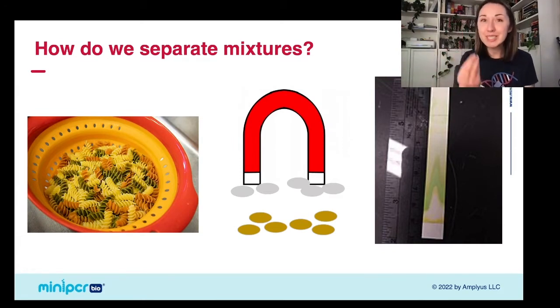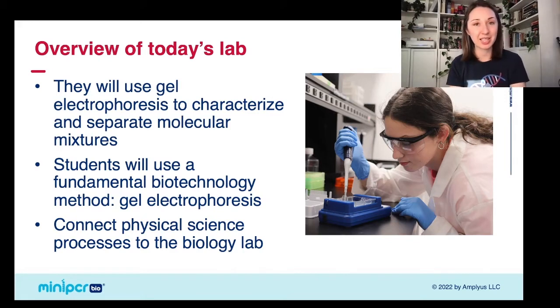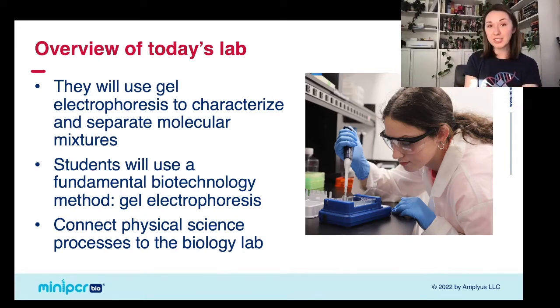And by doing that, we're going to really understand the fundamentals of how gel electrophoresis separates DNA molecules based on their properties and characteristics. So that's what we're going to do in today's lab. Students who perform this lab are going to use gel electrophoresis to be able to characterize and separate molecular mixtures. They're going to really understand the fundamentals of gel electrophoresis as a biotechnology method and technique. And they're also going to be able to connect some physical science processes to the biology lab. These are going to be at an overall engineering level, but also at the level of thinking of things like charge and shape and size when it comes to molecules, not just things that we think about in the physics lab.